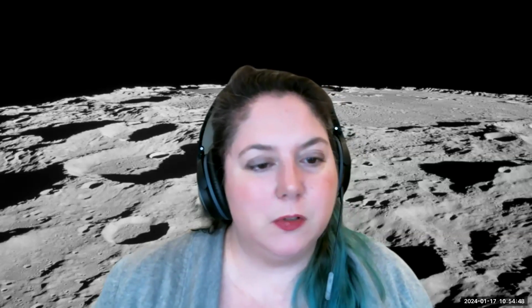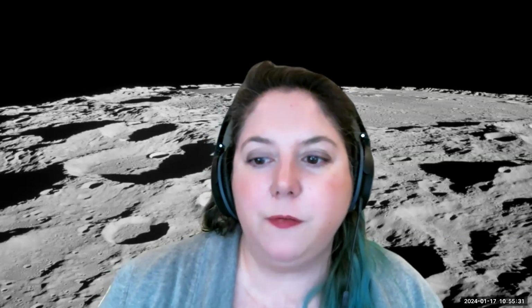I heard from people that specifically if it's all major elements, again, if you have 1,000 counts per second on some major element, and your drift in background intensities is 10%, but the background is like 2 counts. Does it matter? No. But again, usually even when you acquire the standard curve, the MAN curve, remember that you only spend time on the peak. So in practicality, acquiring these curves usually just adds like 20 minutes compared to a traditional run, even though I have maybe 5 to 10 more standards in there. So oftentimes, as Julien said, it's like, is that the best place to cut corners?